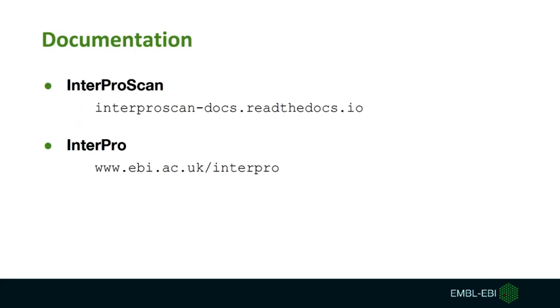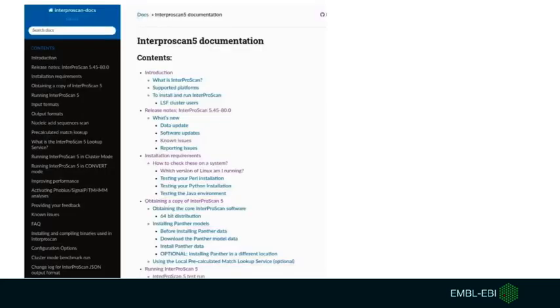If you want more information, you can go to these websites. We have webinars, we have tutorials, and that would be useful for you to be able to use InterPro and InterProScan to analyze your sequences. Read the Docs, as I mentioned, would be a useful resource for you.